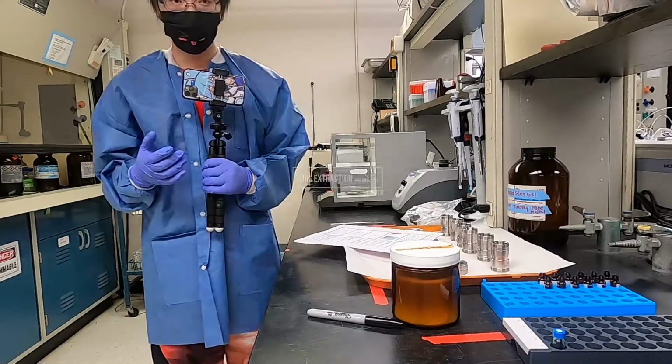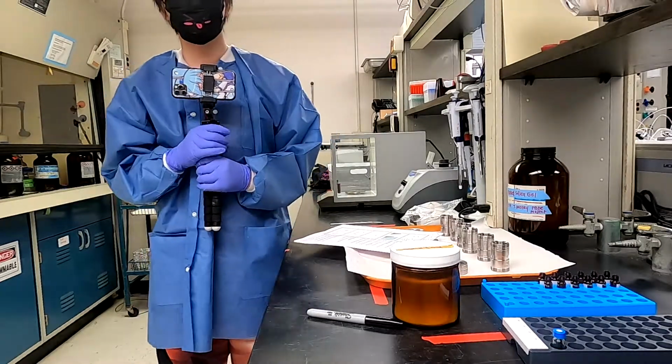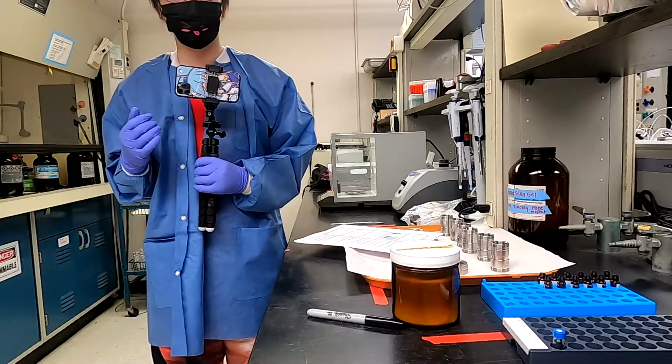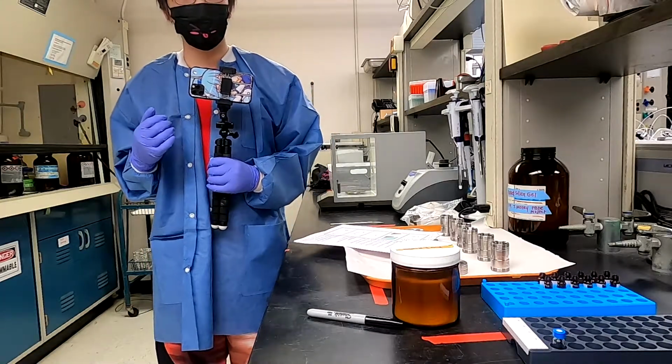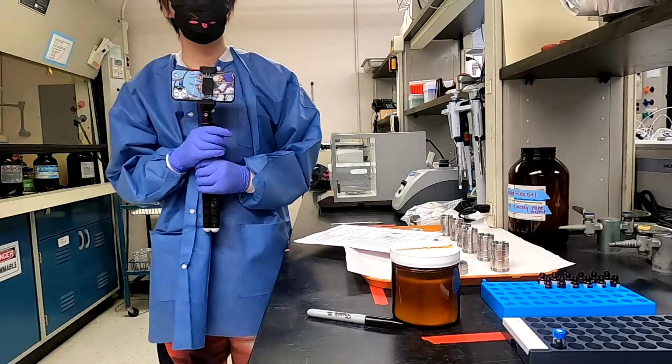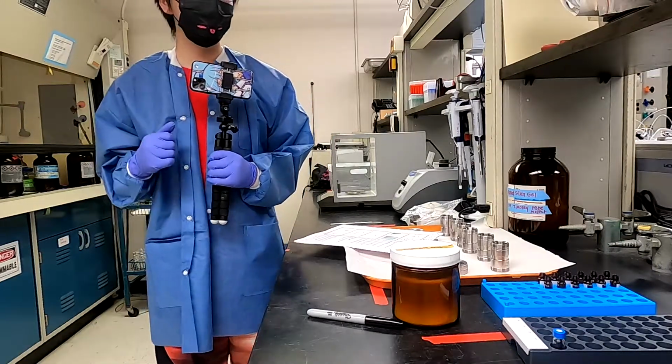See you again. And this is a follow-up of the soil sampling video. Today I'm going to demonstrate how I extract the DDT from the soil samples and prepare for GC analysis. In addition, I will also do a brief introduction about how I do the data analysis.